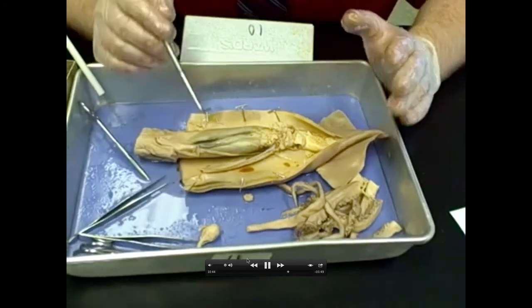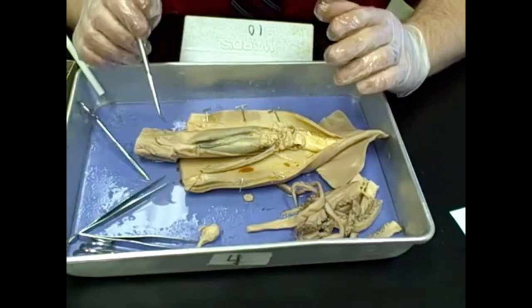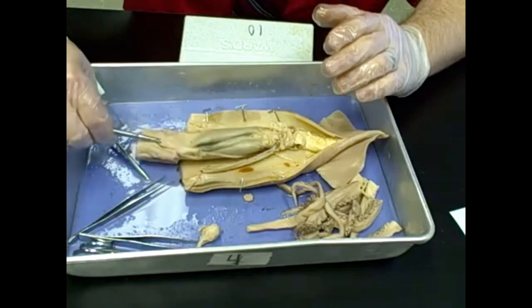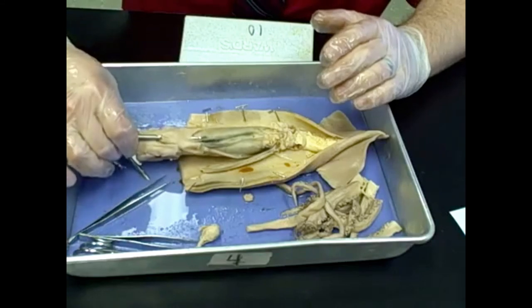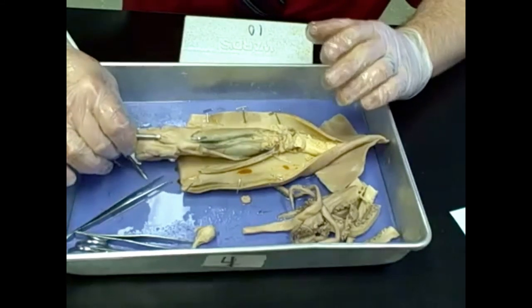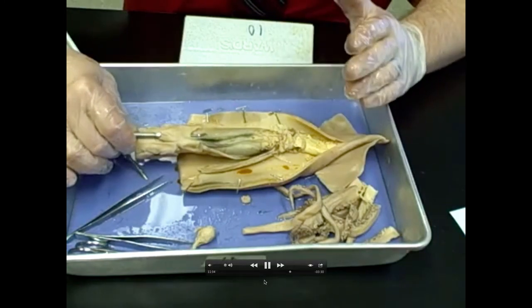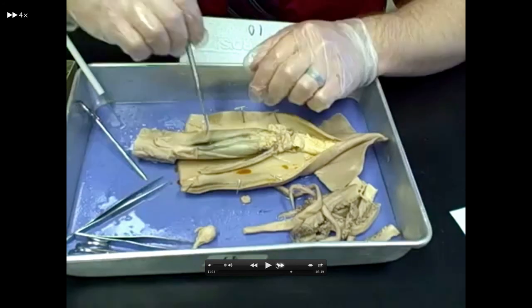So now he's going to take another dissecting tool. And these are your teasing needles that he's using, at pointing at it, or lifting things up, or showing you different things. I'm just going to fast forward some more.